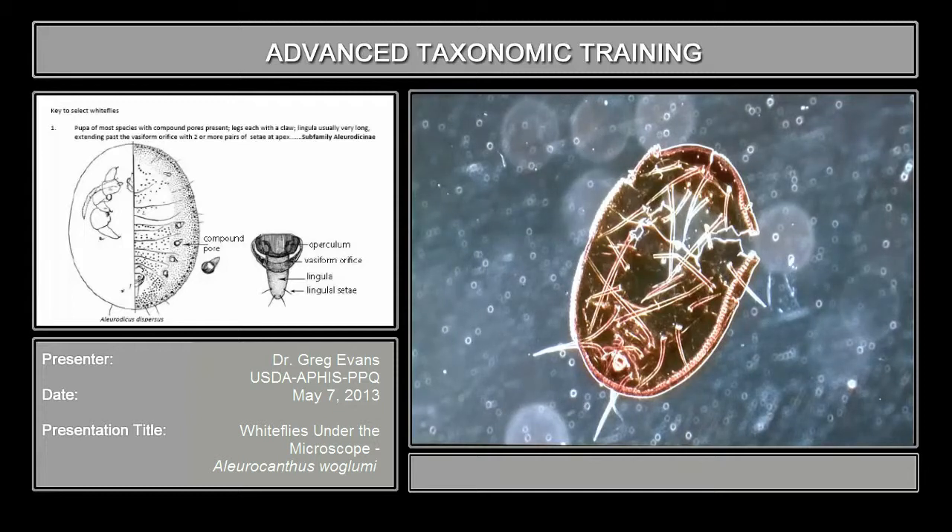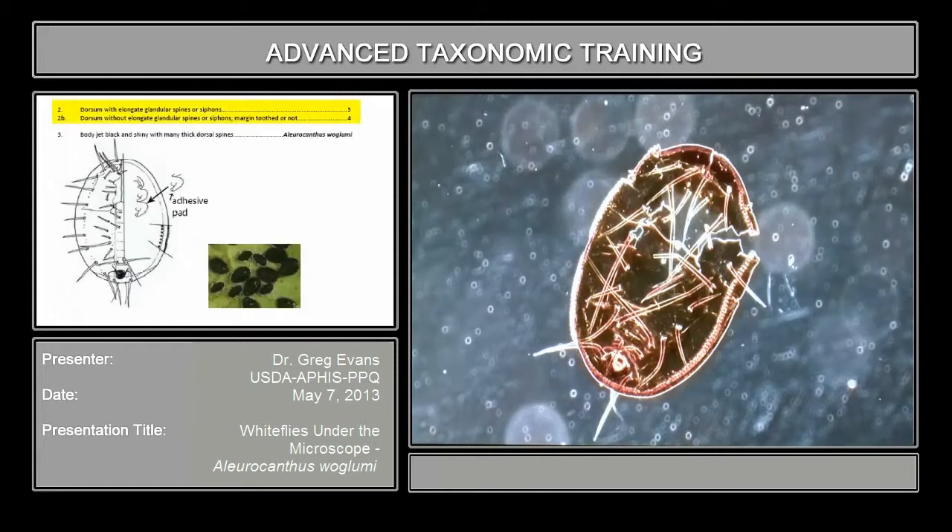We go to couplet number two. It says dorsum with elongate glandular spines or siphons, versus not having those. If it's the other character, they'll just have short flagellate setae, which sometimes may be long but they're very thin.